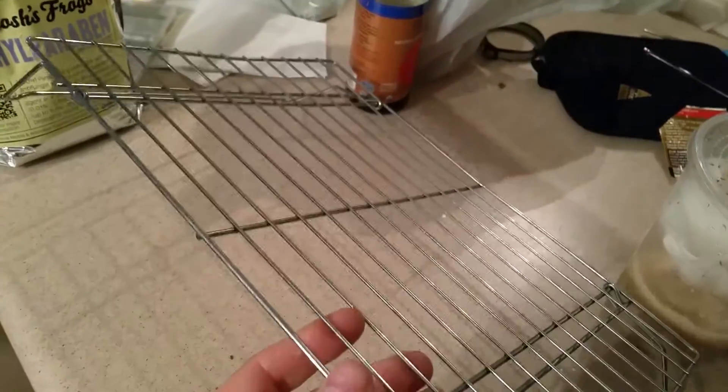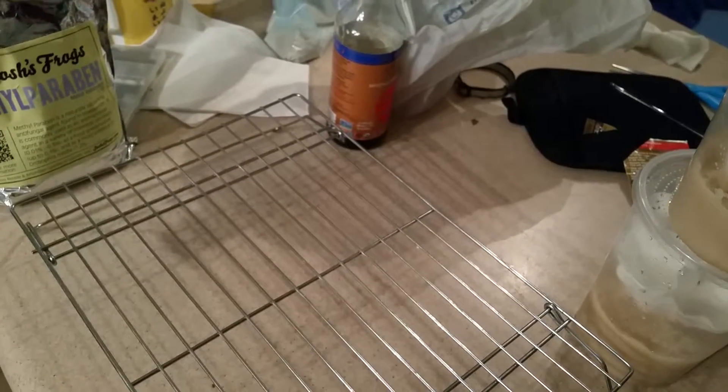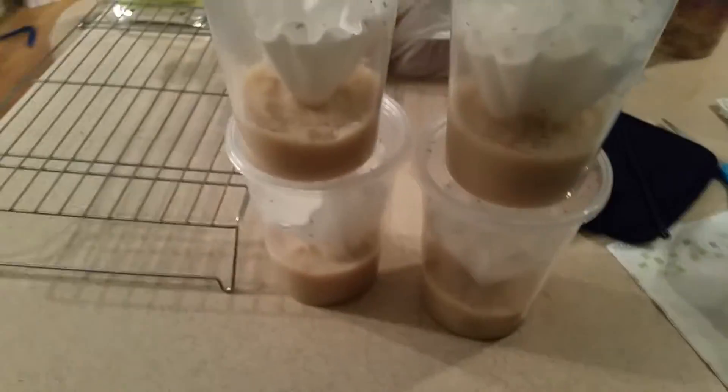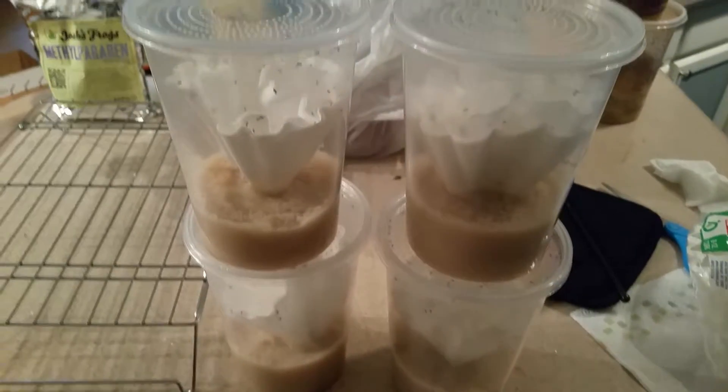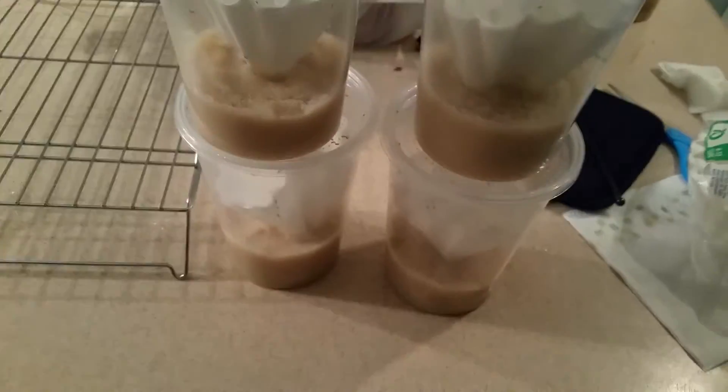One thing I forgot — you need your cultures to cool down before you start adding flies. I found this rack at a thrift store but you can get them cheap at Walmart. It gives you some surface area because if you just put them on the counter they'll take longer to cool. Anyways, this video is about seven minutes — hopefully this helps somebody. Later!